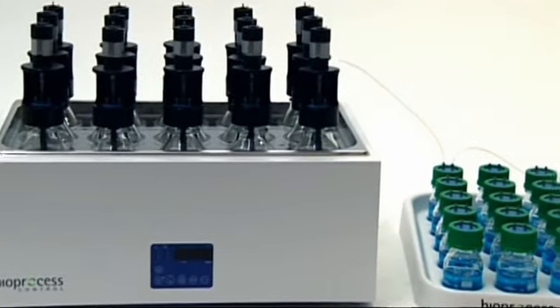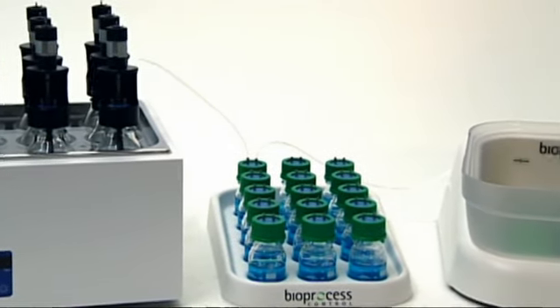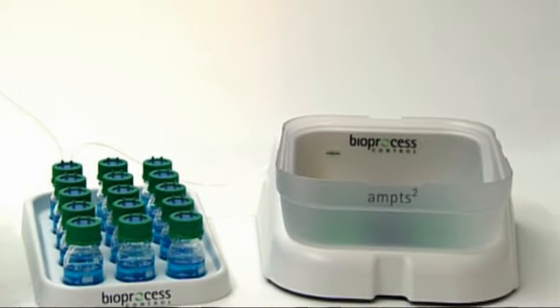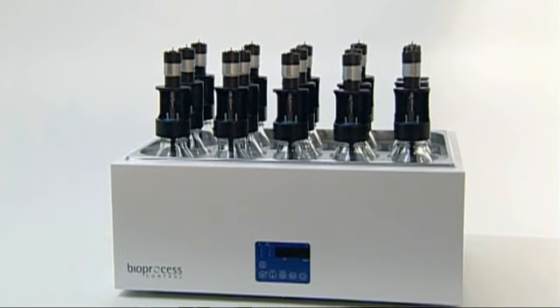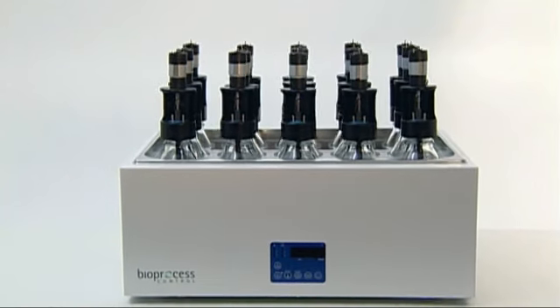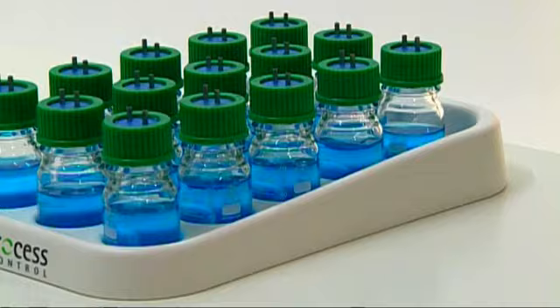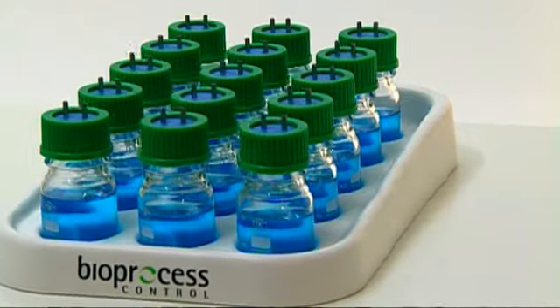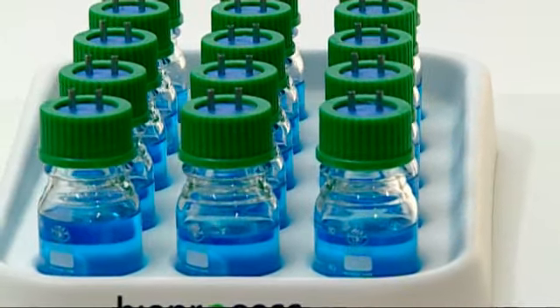The AMPTS-2 is an analytical instrument for estimating biochemical methane potential and anaerobic biodegradability. The incubation unit includes 15 500-milliliter reactors with mechanical agitation, speed and run-time control. The CO2 removal unit allows users to easily monitor gas production in real-time without offline gas composition analysis.